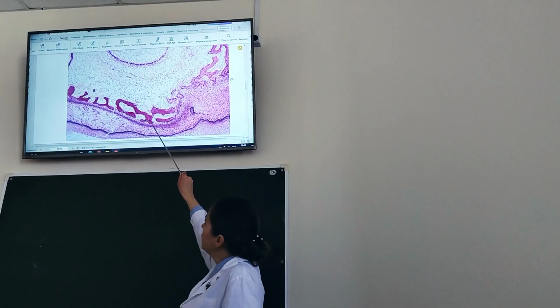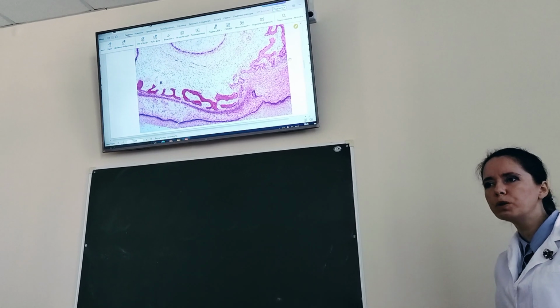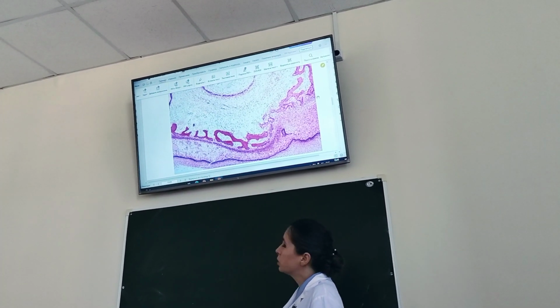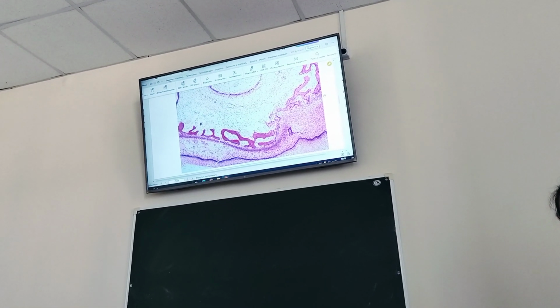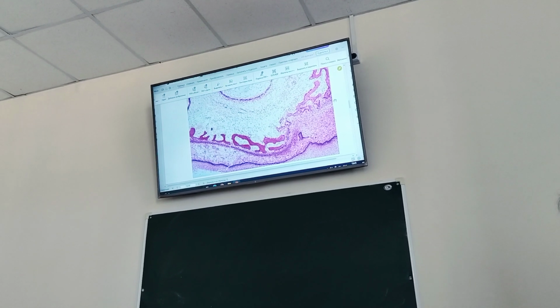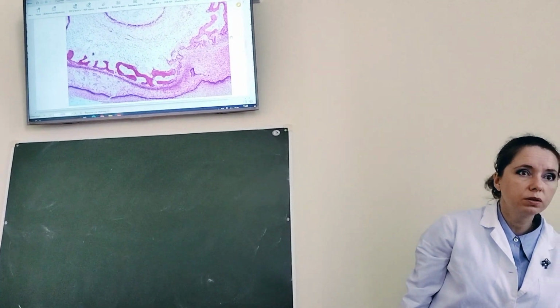My interest is this bright oxyphilic network of primary bone trabeculae, which are composed of what? Osteoid. So here I can see trabeculae of osteoid. Osteoid is a non-mineralized collagen matrix. We remember collagen shows oxyphilic properties, so these trabeculae show strong oxyphilic properties, bright pink color, surrounded by embryonic mesenchyme. This is primary bone, not organized.